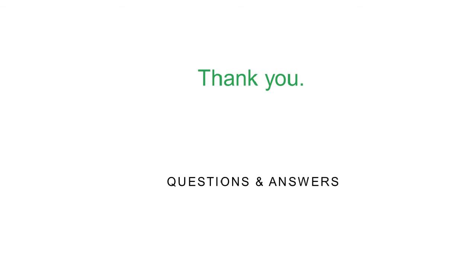Excellent. Thank you. We have another attendee who wants to thank you both for your talks and would like to know from Nick what the main elements are that they should consider for their lab to set up simple Raman spectroscopy. Oh, okay. It always depends what you're trying to measure.